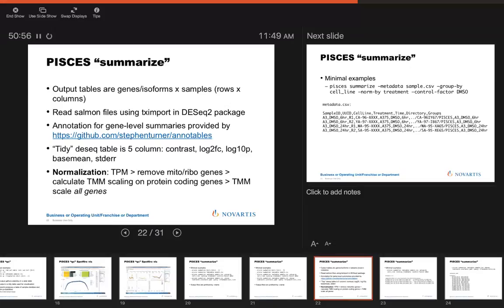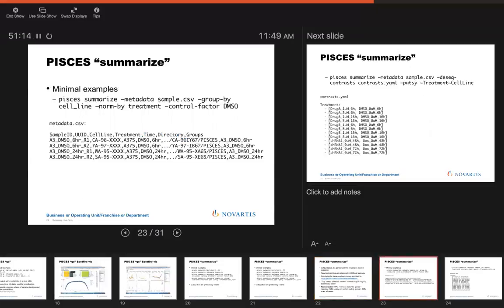I think you don't need to do that. I'm a bit worried about applying those factors. Yeah, this is the feedback that I was hoping to get actually. I think it's problematic, and maybe what I'm doing is not appropriate. I'm definitely willing to admit that. Although, I think your way could extend. What if you're comparing a sample that's total RNA versus poly A RNA, and you want to minimize the effect of the sample preparation? Then I would think you could essentially get your scaling factor from poly A transcripts and then apply it to everything. Right? Yeah, thanks for saying that, because that's actually one of the use cases that drove me to come up with this normalization procedure.